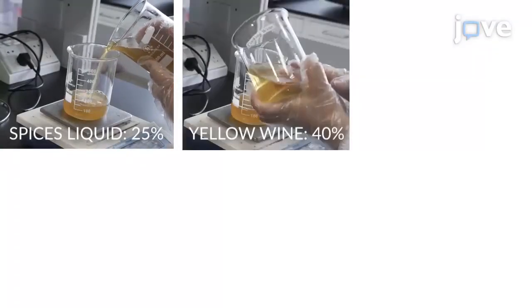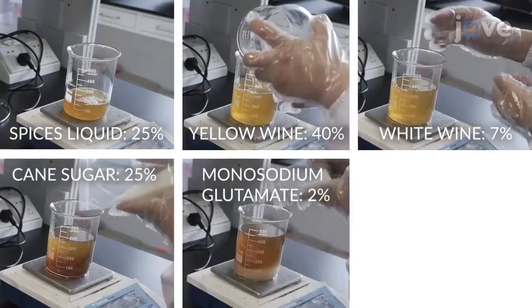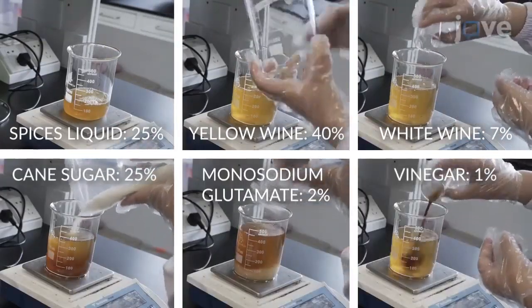To prepare the flavor solution, mix spice liquid, yellow wine, white wine, cane sugar, monosodium glutamate, and vinegar in the mass fractions shown here.